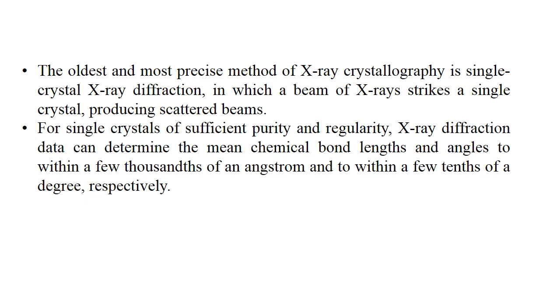Each spot is called a reflection, since it corresponds to the reflection of the X-rays from one set of evenly spaced planes within the crystal. For single crystals of sufficient purity and regularity, X-ray diffraction data can determine the mean chemical bond lengths and angles to within a few thousandths of an angstrom and to within a few tenths of a degree respectively.